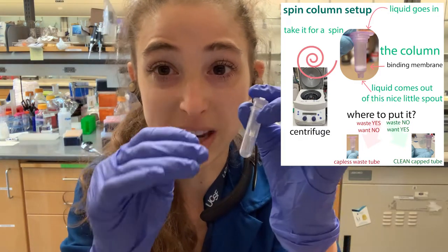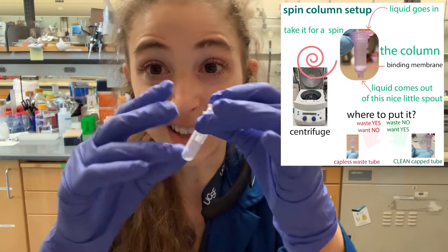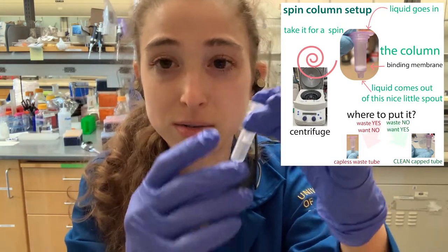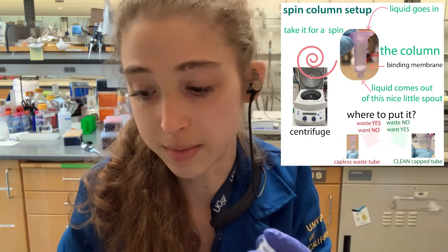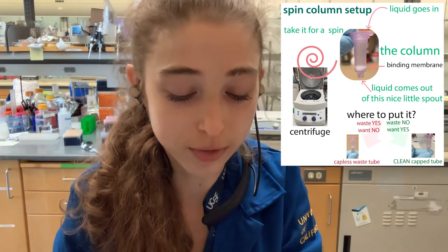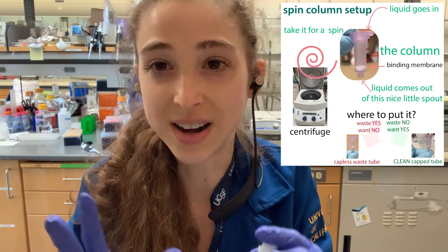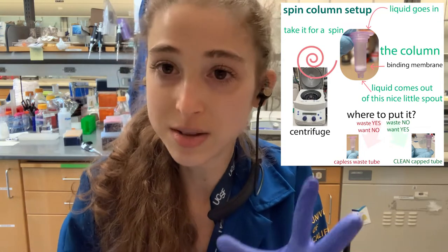Be careful because we have ethanol and isopropanol and stuff, so sometimes these solvents can dissolve the sharpie or whatever you've written on the tube. They make lab markers that are resistant to those sorts of things, which are helpful. Also be careful of dripping.